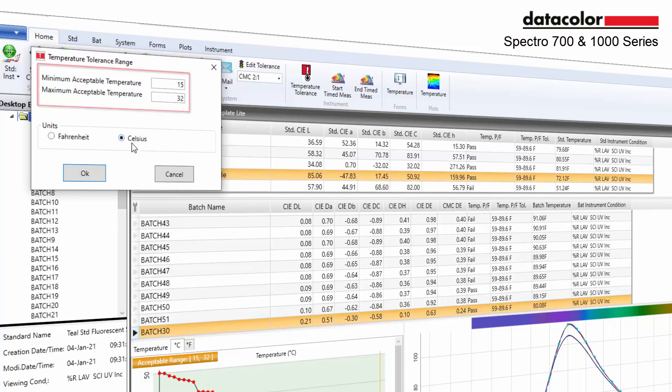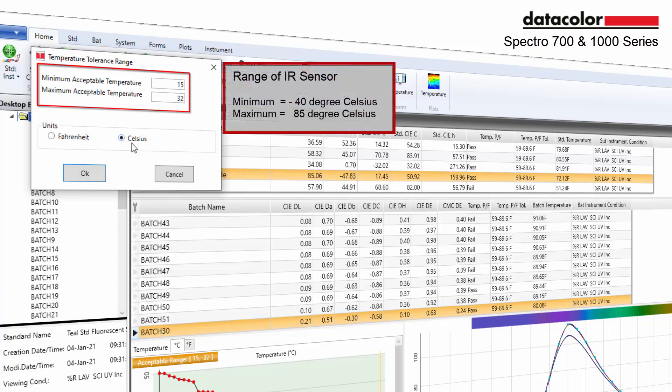The system defaults to 15 to 32 degrees Celsius upon installation.